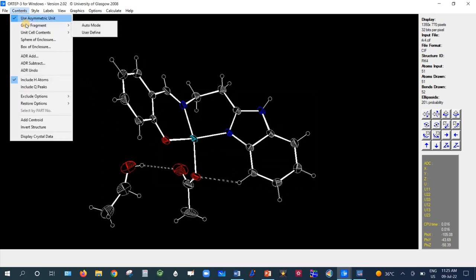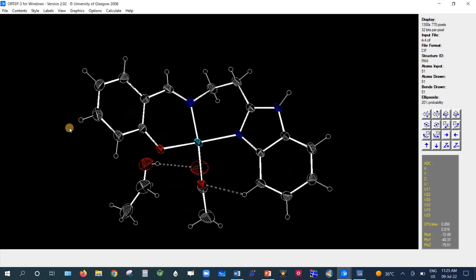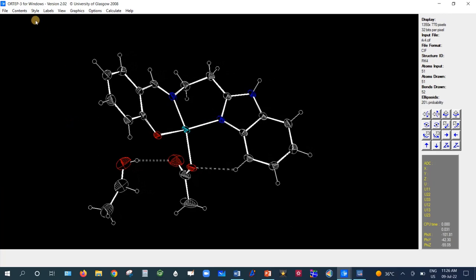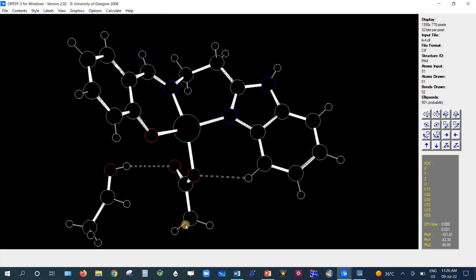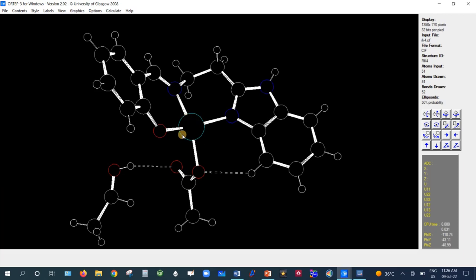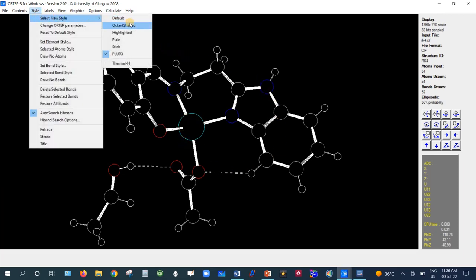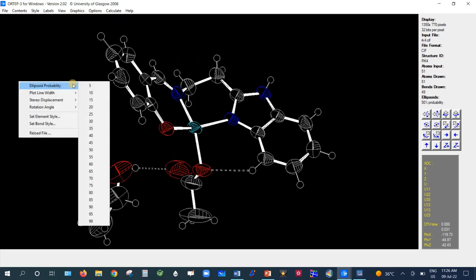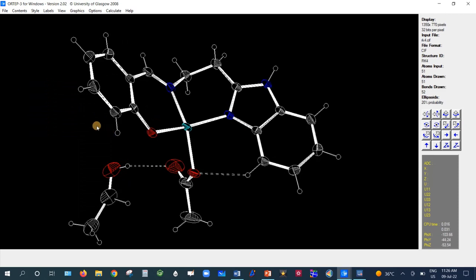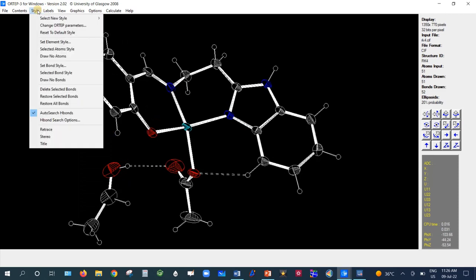Going back to the asymmetric unit, the default Octant Shaded style is the best option. There are also other styles such as PLUTO, which displays ellipsoids as spheres. Returning to Octant Shaded, the ellipsoid probability of 20 percent provides a good visualization.